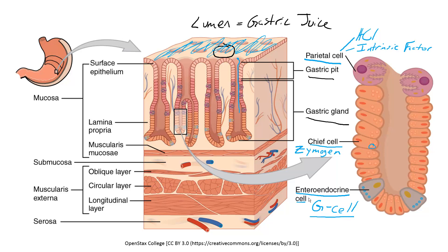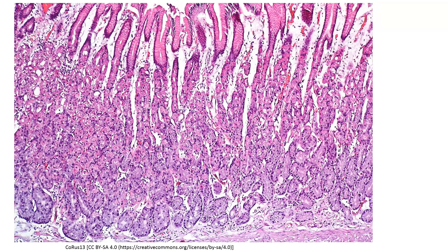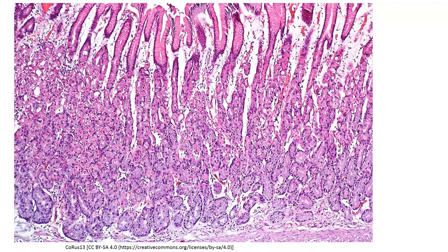Alright, we've seen it in a cartoon — now let's actually look at some real histological preparations. Here we can see a very low-magnification image of the stomach, but we can already make out some of those distinctive features. We can see the gastric pits right here, and you'll notice these surface epithelial cells have a very distinct appearance.